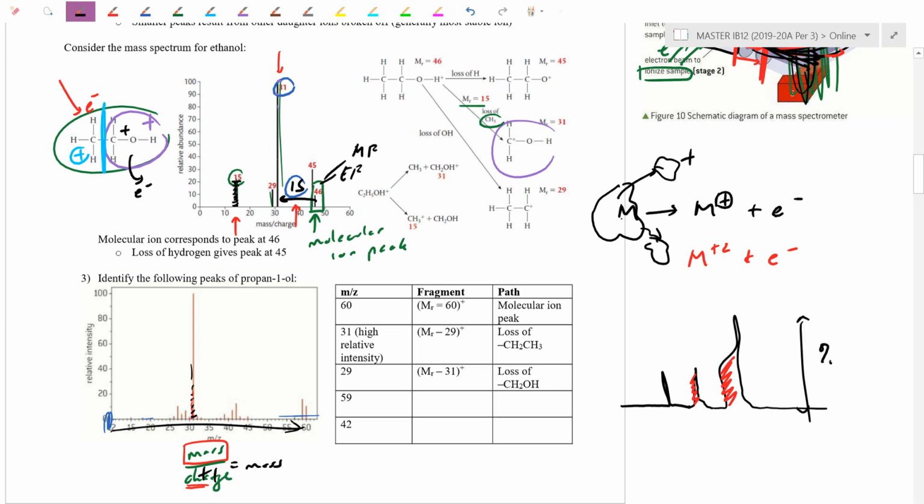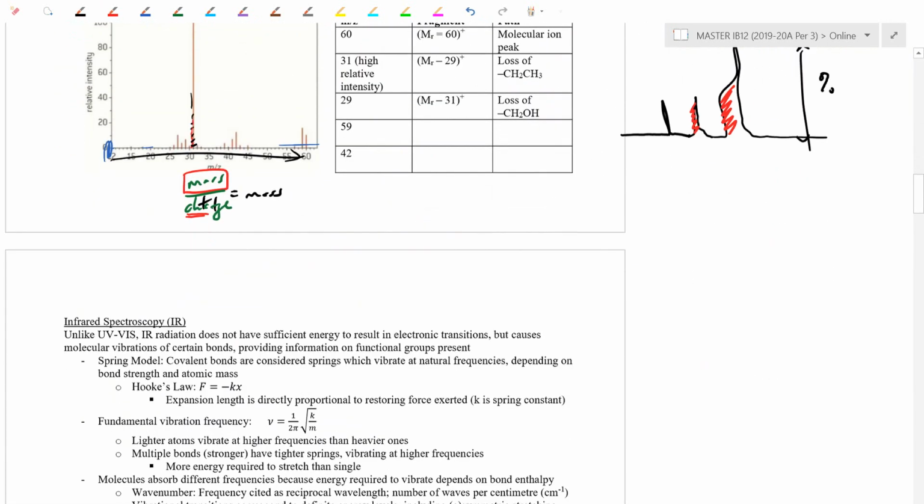If I spend the same amount of time at each given setting, I know the relative distribution of the fragments. Again, we did that for isotopes for the different versions. So in a nutshell, that one there was mass spectroscopy.